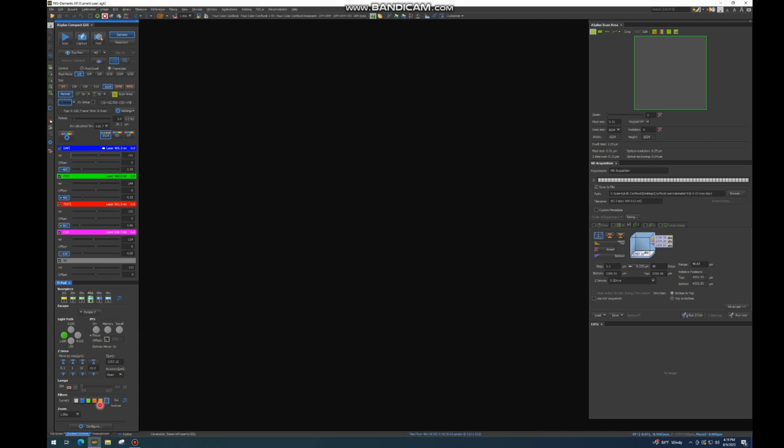So once you click scan, the filter cube will go into this empty position and laser light will start to pass through. If the sample ever looks weird when you're scanning, it might be because the filter cube is still on. So just check that, and you can always click it to this blank position. But like I said, this should occur automatically.